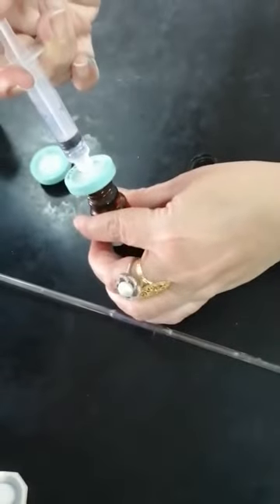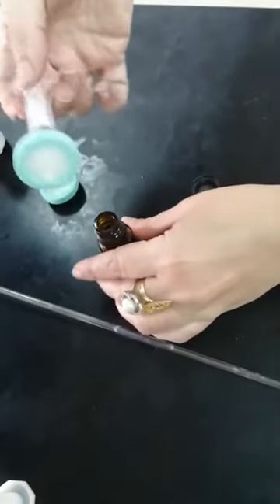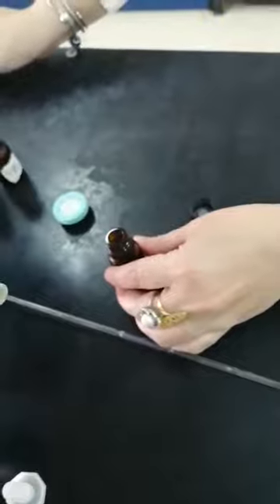This is my sample. I will use a disc filter to filter my sample, just by adding it like that and collecting it in a small bottle. The first drops have to be discarded. This is my filtered sample.